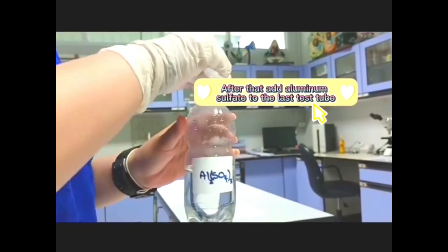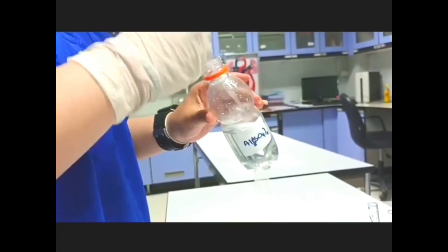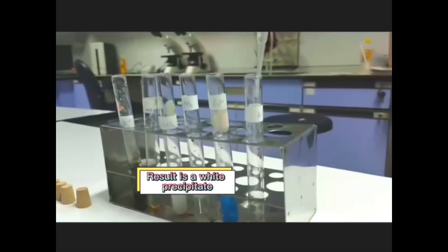After that, add aluminum sulfate to the last test tube. The result is a white precipitate.